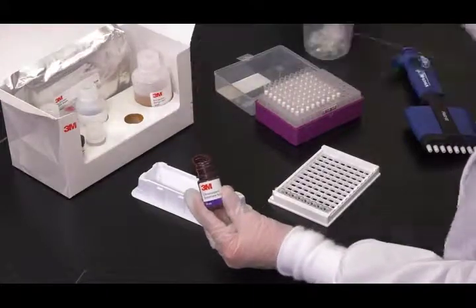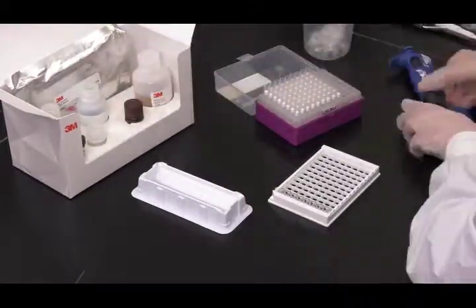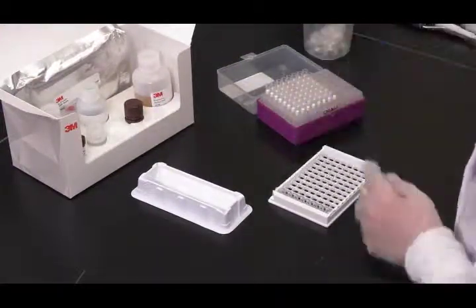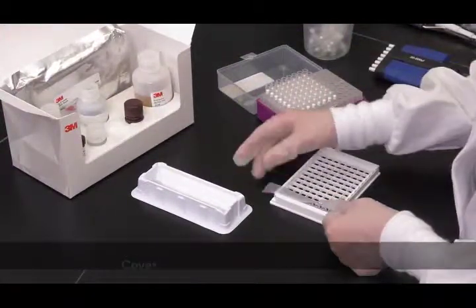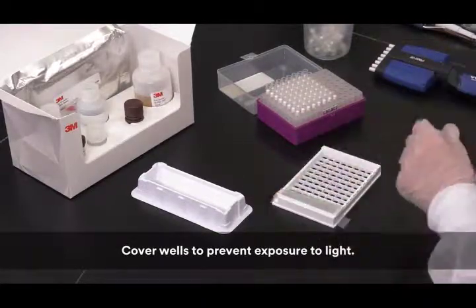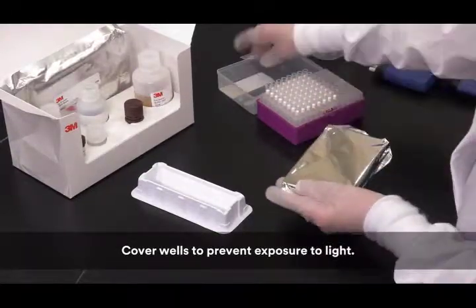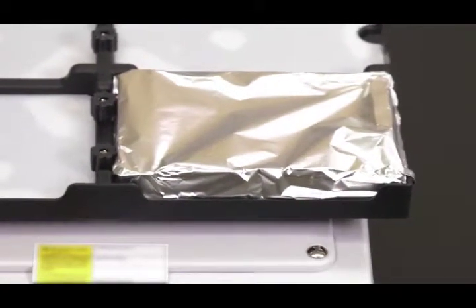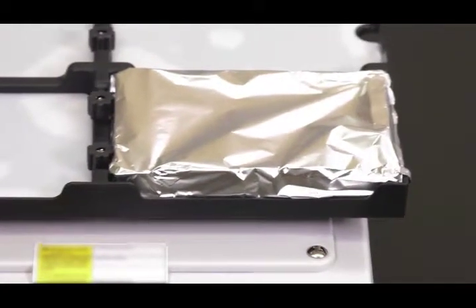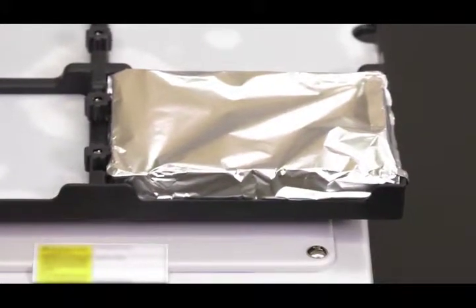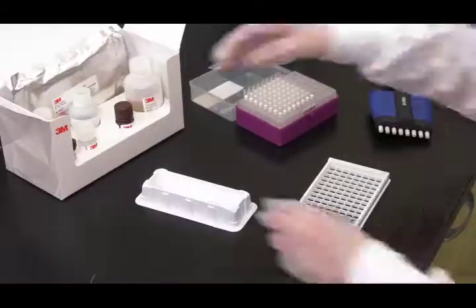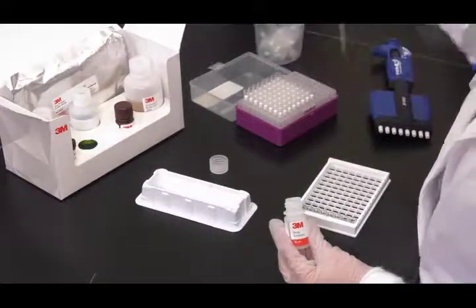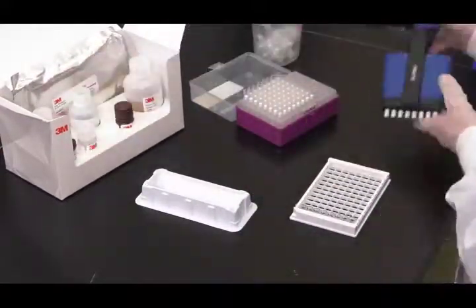Pipette 100 microliters of 3M Chromogenic Substrate Solution into each 3M ELISA well. Incubate on an orbital shaker, again set at 400 rotations per minute at ambient temperature for 10 minutes. After incubation, add 100 microliters of 3M Stop Solution to each 3M ELISA well.